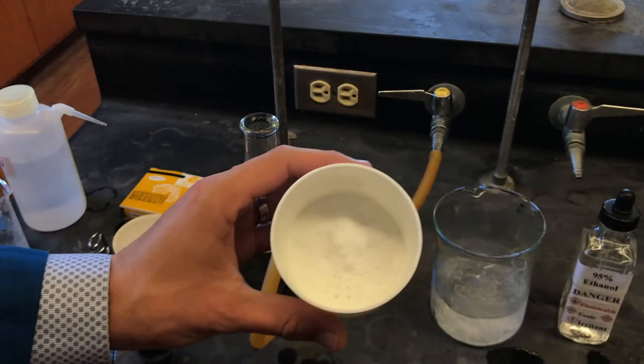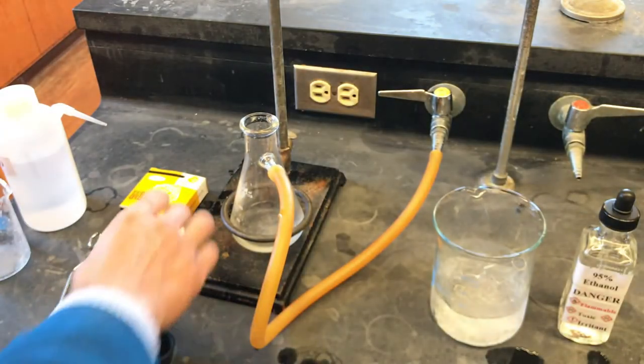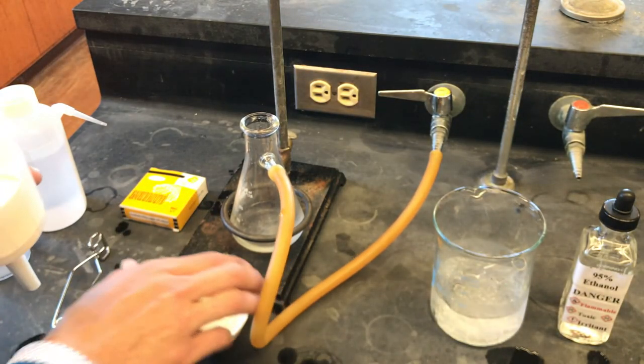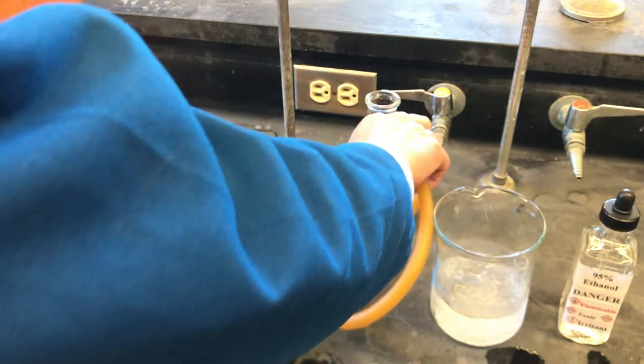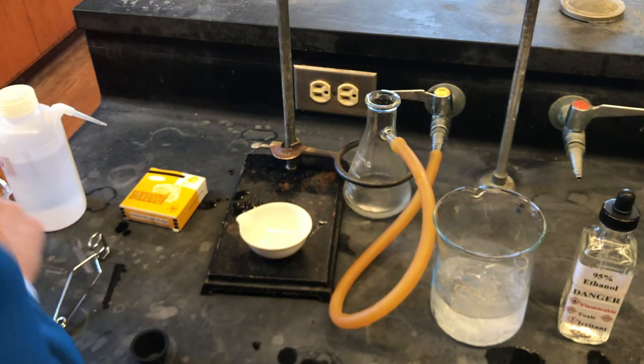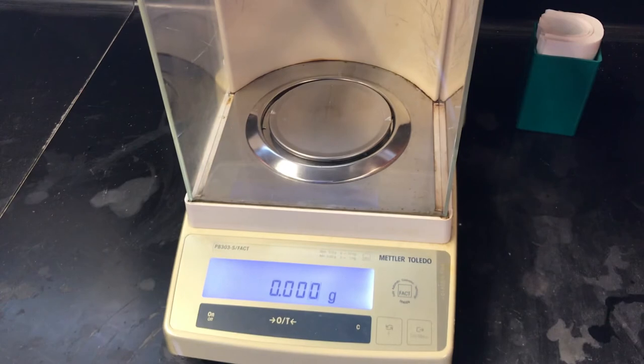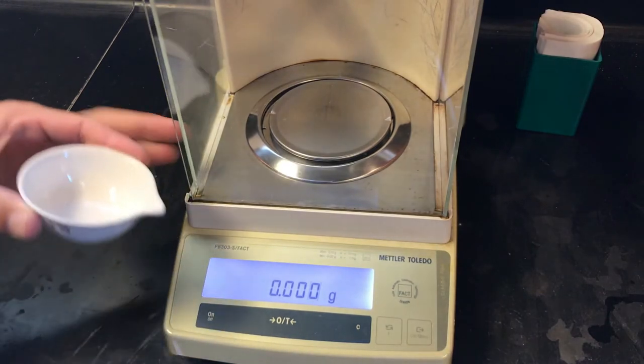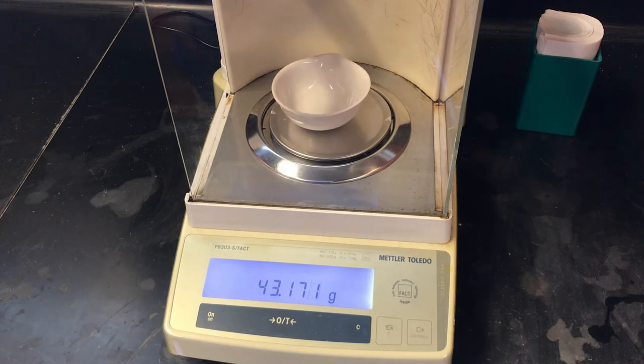You can see our solid isolated potassium alum on our filter paper. However, this product is wet and needs to be dried before a yield can be determined. We will now transfer our wet alum product to a clean dry evaporating dish. But before we do, we need to get an initial mass of the evaporating dish, which comes out to 43.169 grams.